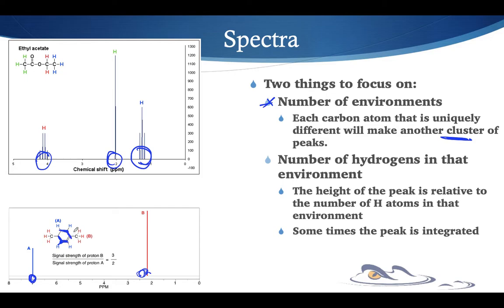So their environments are not unique. They have similar environments to each other. And we'll see a couple more of these. Another one that we're going to see that's similar are these carbons right here, yes? Looking at these carbons, each of these carbons is bonded to an arene and it has 3 hydrogens on there, right? So both of these are similar to each other.